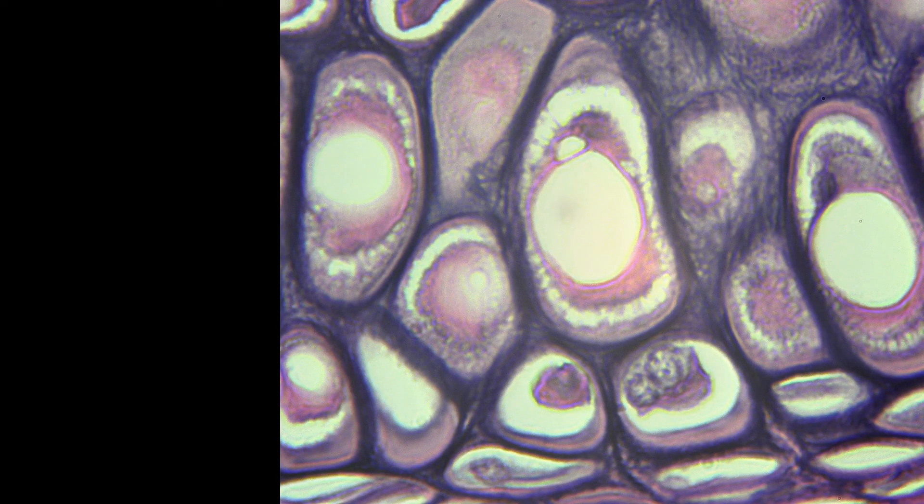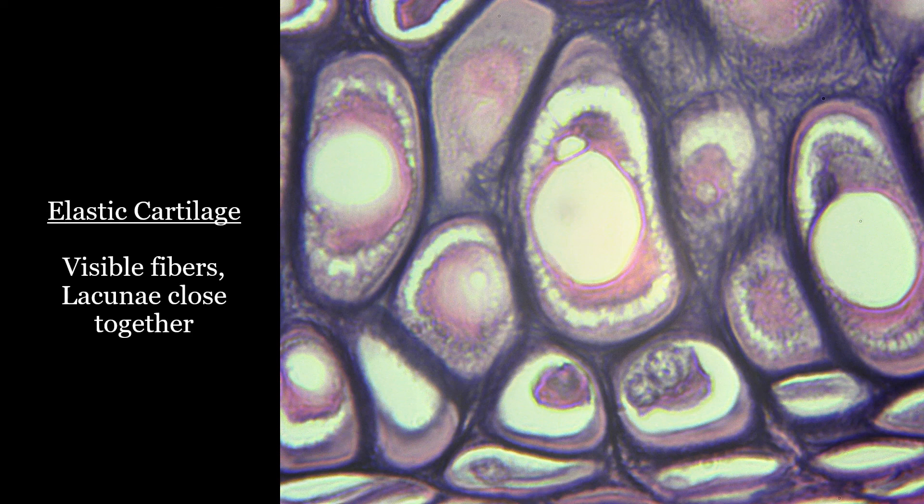This one would be the elastic cartilage because you have the lacunae spaced close together, and you see the purple fibers in between.